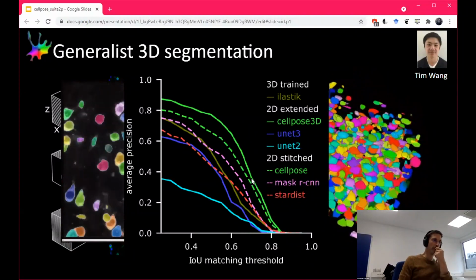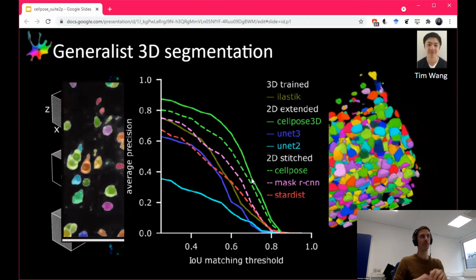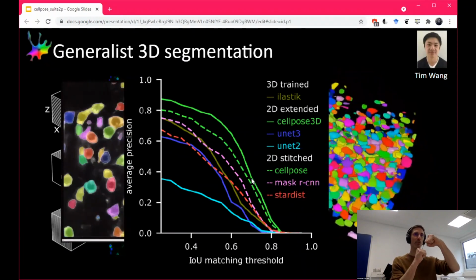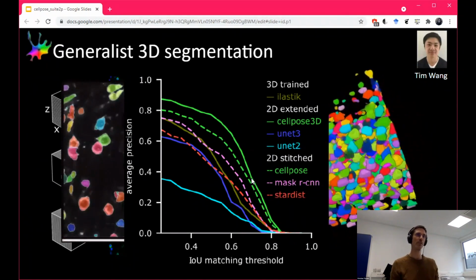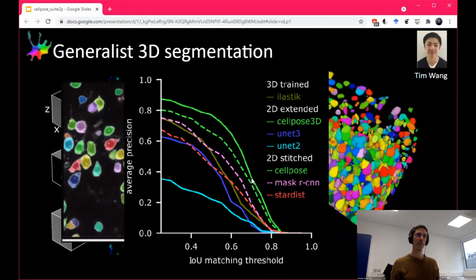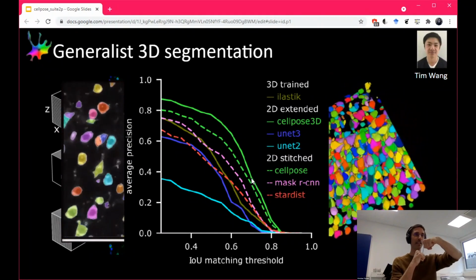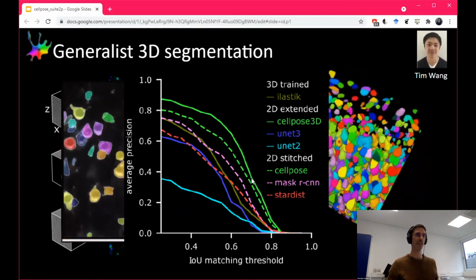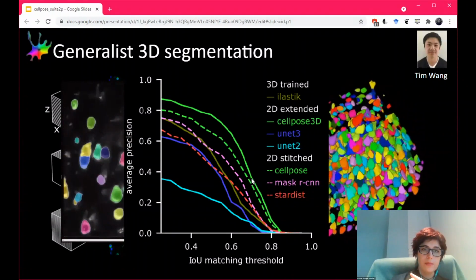And then I also, oh yeah, sorry, go ahead. Sorry, with this stitching, I've seen this popping up in other places now, but I actually don't get it. If two cells in 3D are very close or almost touching, would it think it's one cell? Is there anything clever so that it doesn't join stuff that's touching along the z-axis? Yeah, so that's a good point.